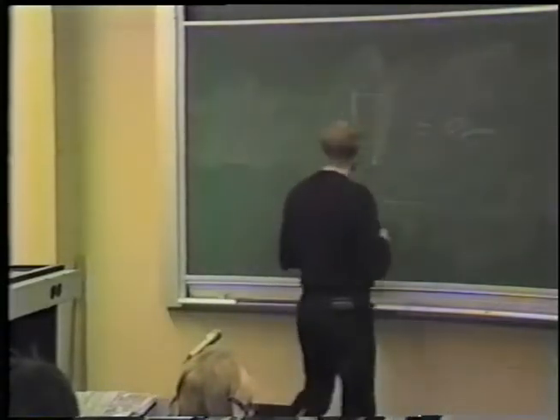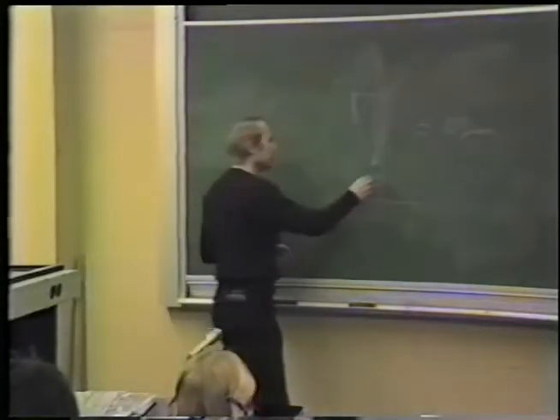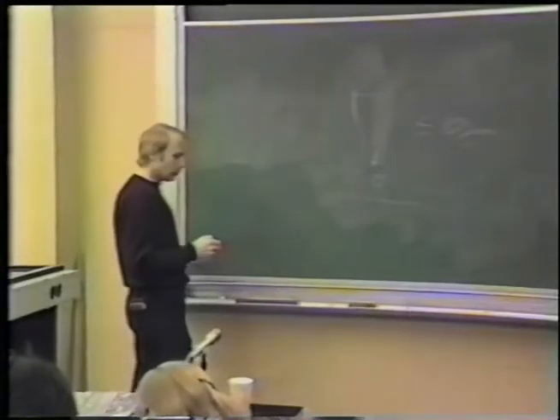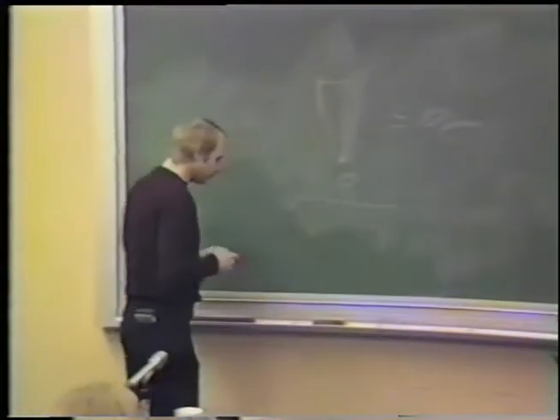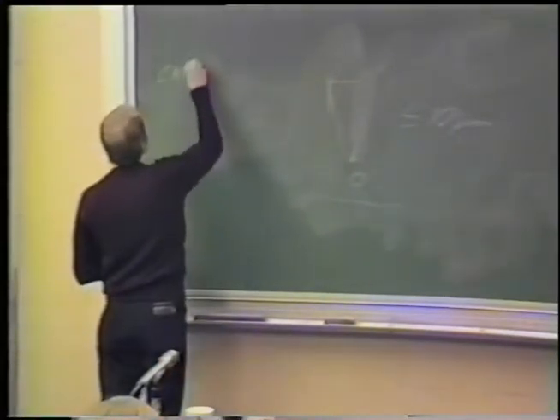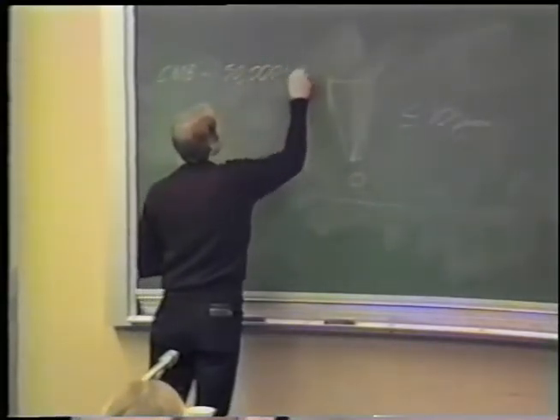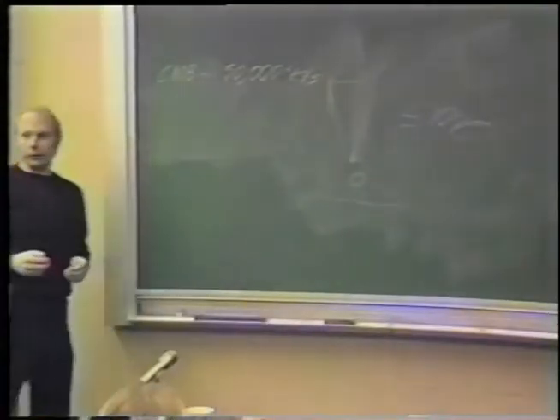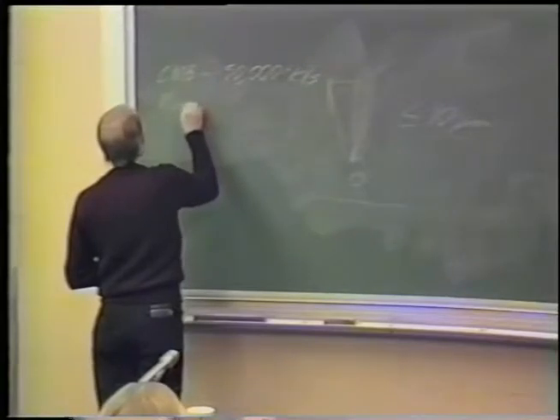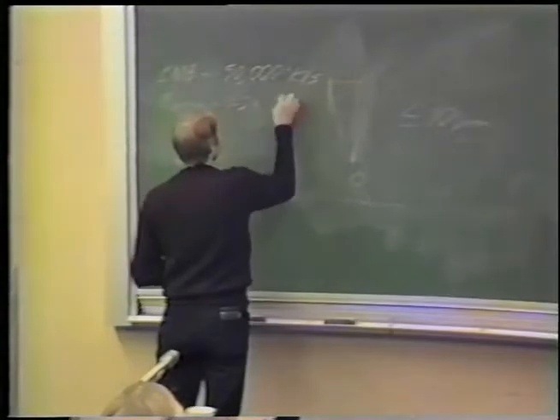And you're taking advantage here of moving a sphere rapidly through a cool medium. And you can get very nice freezing. I should mention that the rates of cooling that one typically attains in cold metal block freezing are about minus 50,000 degrees Kelvin per second. In hand dipping, plunging or whatever, they're about 1 to 2 times 10 to the fourth.